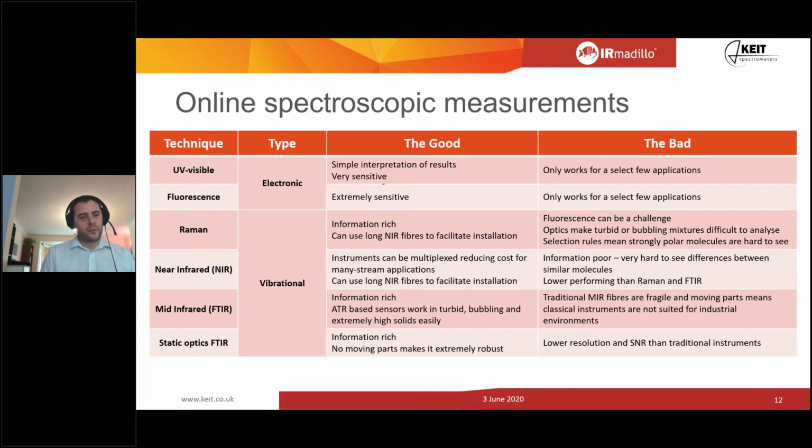And we have Raman spectroscopy, which is a very special type of spectroscopy. I'm not going to go into too much detail on it. It's like mid-infrared in the type of information it gives you, but there is something called a selection rule for it, which is dwelling far too close to quantum physics for a lunchtime webinar, that makes it very difficult to use for some applications.